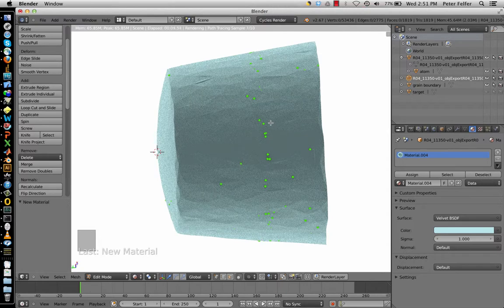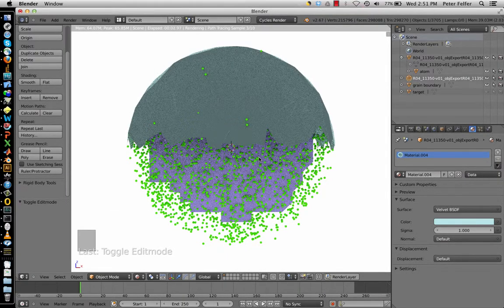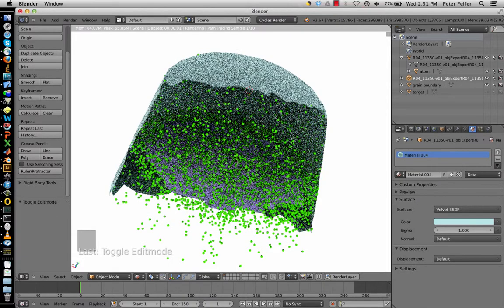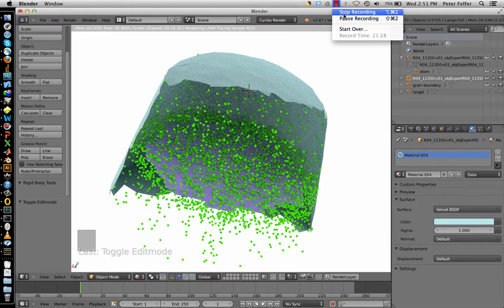Okay, something didn't go quite the way I had intended. So we'll go into edit mode again. I think I just was... so there we go. You get a very nice rendered image of your dataset. Of course, you can play around with the lighting, you can play around with where things are because there's a bit of shadow in there. But yeah, this is our first analysis object created. You can see it's not particularly complicated.